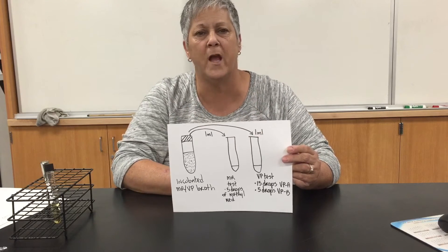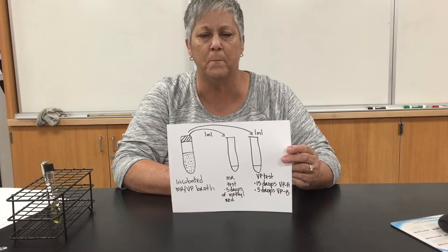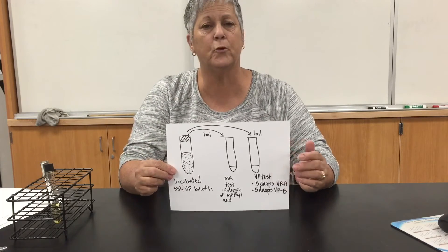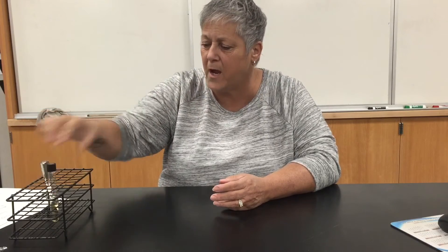To run the VP test, you're going to add 15 drops of VP reagent A and five drops of VP reagent B. If the broth turns red, that's a positive VP reaction. The VP reaction may take up to an hour to complete. In my experience, you'll usually see a good reaction in about 20 minutes, but some organisms can take as long as an hour. Let the VP tube sit undisturbed — don't pick it up and jiggle it. Just let it sit for however long it takes.